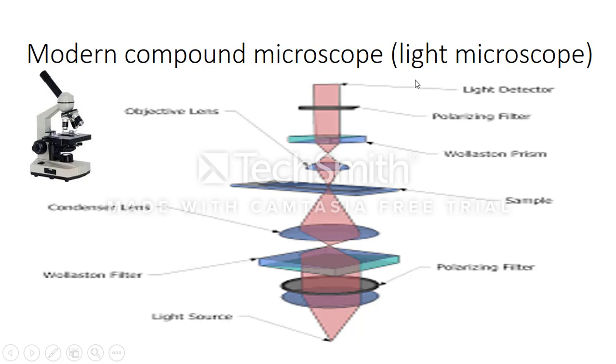So also keep note, the light microscope sends light from the bottom here underneath the specimen. And so here's the light source down here, and that shines through, and that's towards the objective lens and to the light detector. The light microscope operates between 300 and 700 nanometers.